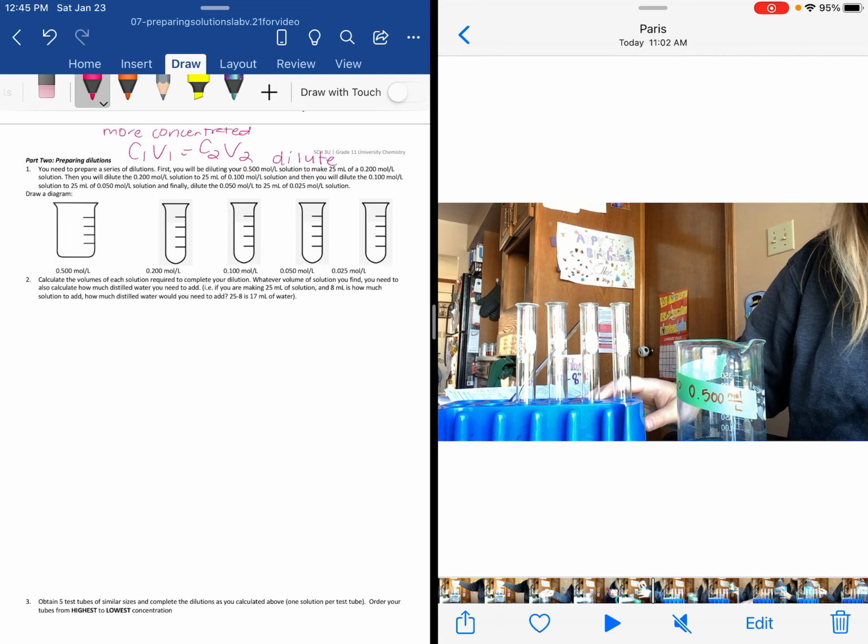Could you go backwards and take water out of the solution, evaporate it, and then get back your concentrated solution? Theoretically, yes, but not really in a quantitative way, right? So that's not usually practically what we do. So we're going to look at, usually, and this is, again, if you're interested in SciTap or whatever, this is usually what we would do.